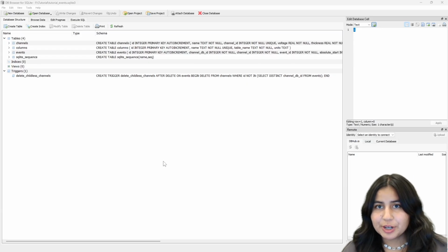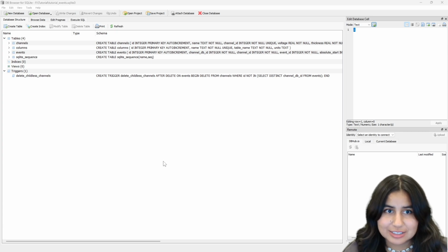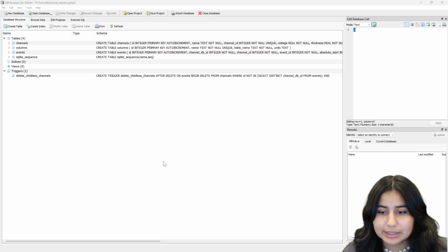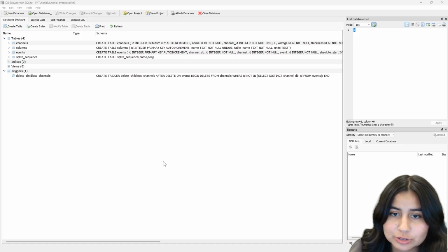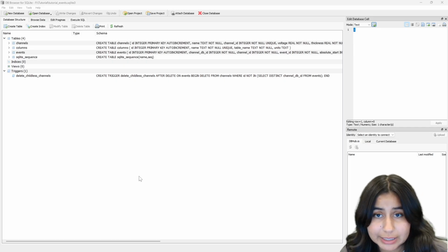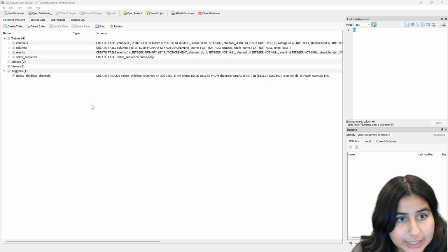So as we saw in the previous video, we have efficiently and effectively written the 4 channels into our database. What is really cool is that what's getting written is only the data immediately within and immediately around the event, which means that it's ignoring all of the open pore baseline in between all of these events where there is nothing. So that saves us a lot of space. And now if we check how that database looks, we recommend, if you want to check your database, you can use DB Browser for SQLite. It's a free, really good tool for checking them.